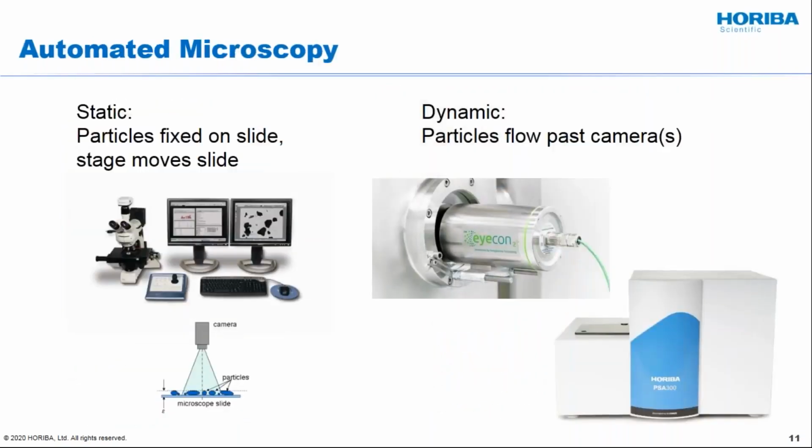Now here we can see what I guess typically would be known as the gold standard for your particle sizing, and that's going to be microscopy. I think as you can see on the left there, it's not very big, unfortunately, but you can see you're actually looking at the images of your particles. So you can actually sit there, measure different dimensions of the particles. You can go through and count the particles as they're going in front of the camera so that you would have some idea of their concentration.